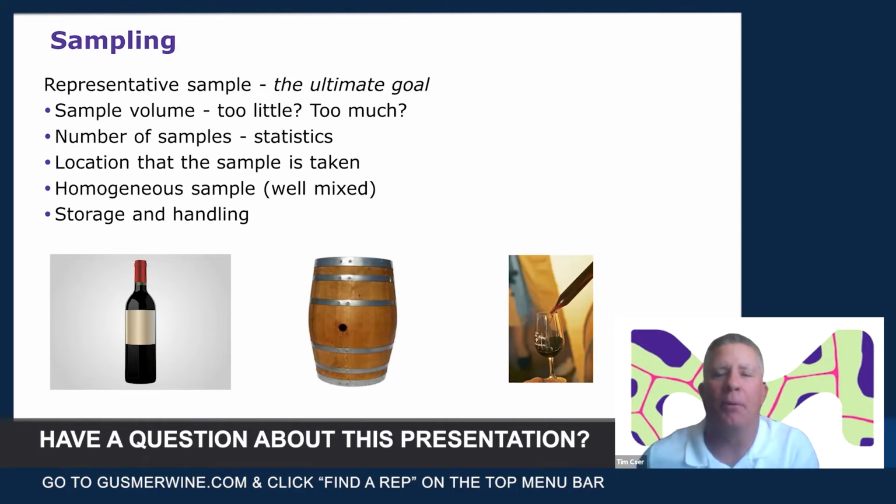So, representative sample. This is a good point because oftentimes we say, okay, I might sample water, I'm going to take 1 mil. Now, is 1 mil a representative sample of my entire water system? Most likely not. So we want to do a representative sample, and that's going to be up to you. Could be up to your method. You might do 100 mils, maybe a bottle. It just depends. And then for your other sampling points, you really need to make sure that you're looking in the right places, upstream and downstream, sampling in the correct spots and in numbers so that you can really find that contamination.